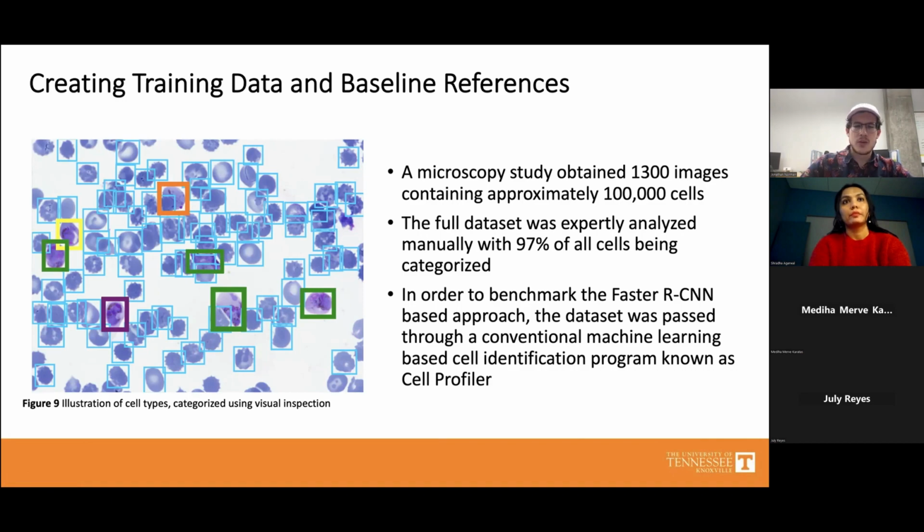So in order to do a good quantitative study, because the goal here wasn't so much to go through all of these images and actually identify malaria cells. It was more to create this neural network as a tool for future research. Because presently, convolutional neural networks for image analysis have been frequently used for biological imaging, but one of the big problems is that most of the time the information remains proprietary and it never actually gets published as a functional tool for other labs to use. This study really wanted to change that by actually creating a useful implementation of computer vision for future research.